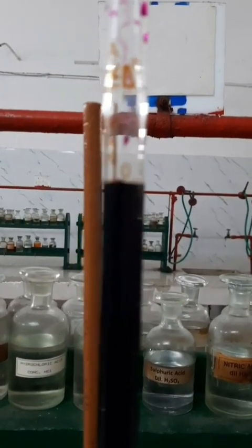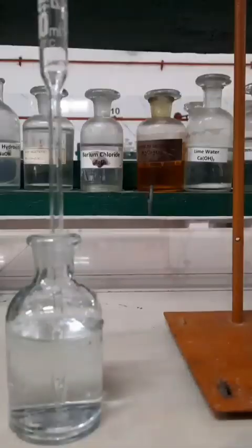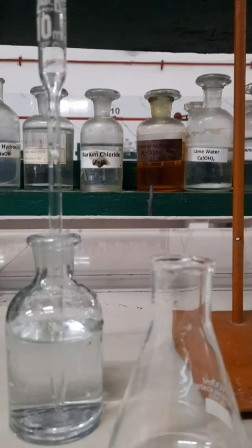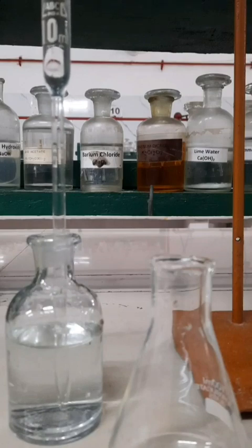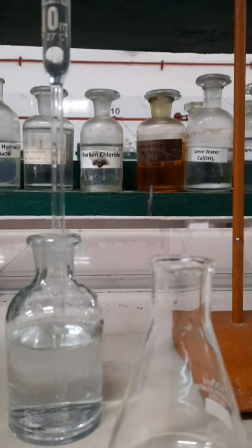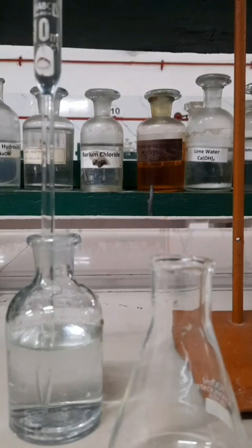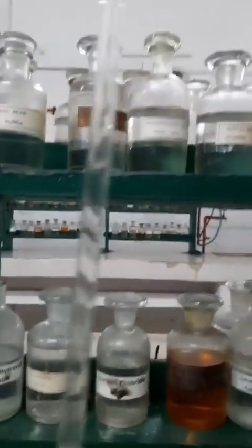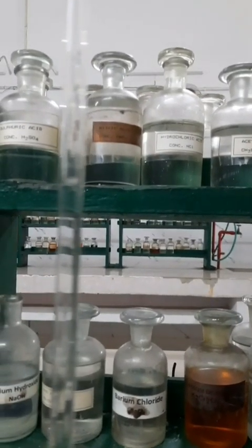Now you have to repeat the experiment again. You have to repeat this experiment till two consecutive readings remain the same. Fill the burette again and adjust up to the 0 mark indicated on the burette, and then pipette out 10 ml of Mohr salt solution again and transfer it into the conical flask. Here I am adjusting the lower meniscus of the solution up to the scratch mark indicated on the pipette, and then I will transfer it into the conical flask.